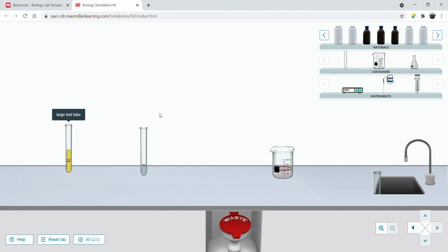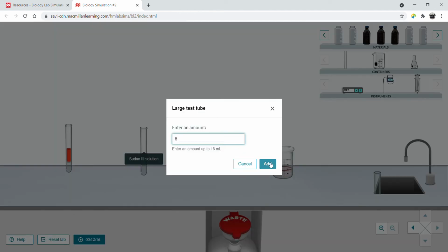Okay, guys. The dog's barking. Sorry. Then we're going to add 6 mLs to the water.